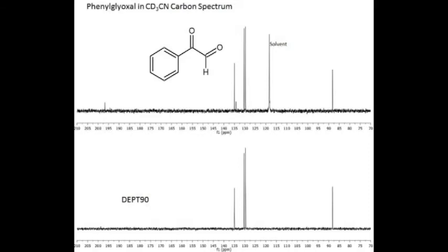Then we ran the DEPT 135, and interestingly the DEPT 135 showed nothing new. It looked exactly like the DEPT 90. It certainly did not show a CH2 group, did not show a methyl.